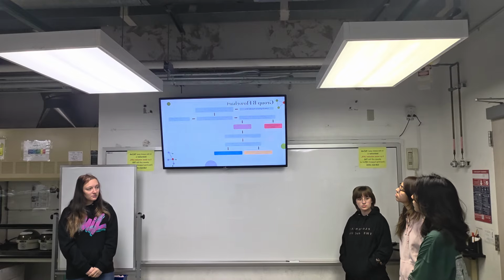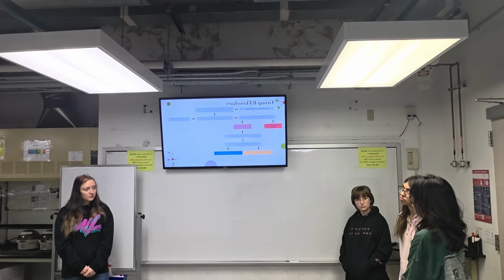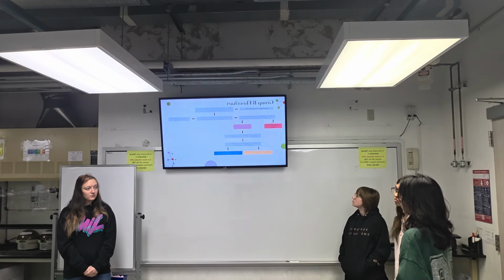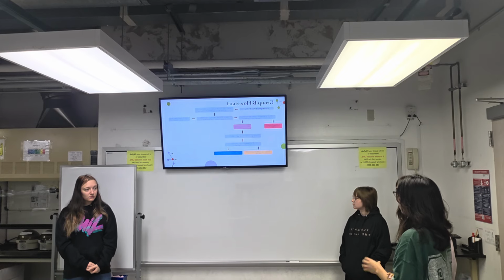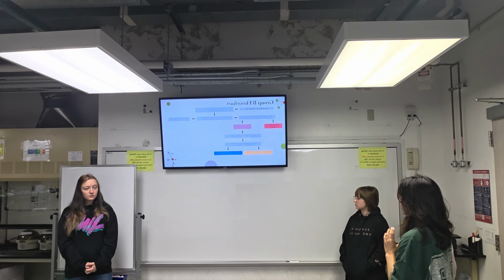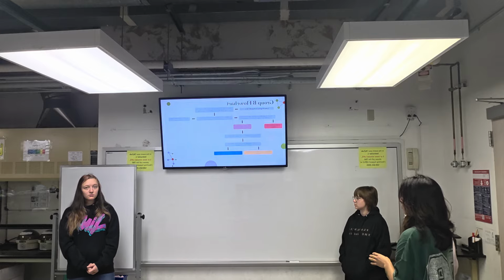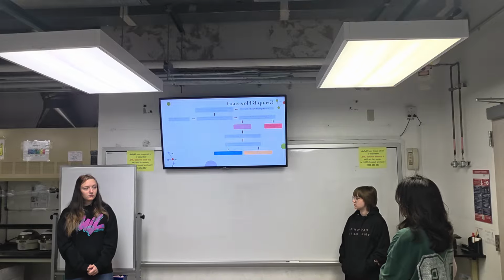For our flowchart, I went with the dilution for the second step, and did the Hirsch funnel process first with all of the dyes together in one vial, and then the mordant was separated onto the filter paper, and that's how she got the red dye by itself.